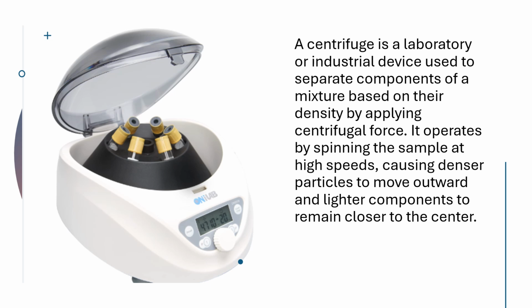Basically, this centrifuge follows the sedimentation principle and Stokes' law, where relative centrifugal force depends on speed, that is in rpm, and rotor radius, right? It is widely used in biotechnology, pharmaceutical and diagnostics for tasks like blood separation, DNA extraction and protein purification. In the pharmaceutical industry there are several test solutions you need to centrifuge, and you need to take the supernatant solution for further analysis and testing purposes. So overall, the centrifuge works based on the principle of sedimentation, right?